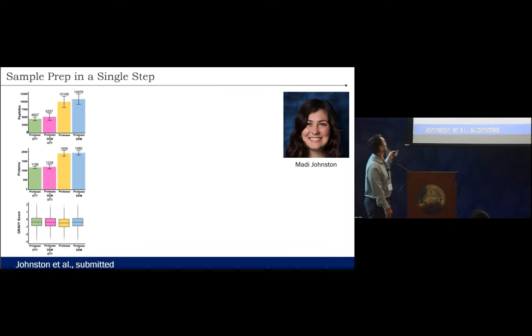So this is some work that Maddie is doing in the lab. And so what we realized basically is that our first step has always been heating up our sample in the presence of a non-ionic surfactant, dodecyl maltoside, DDM, for 1 hour at 70 C, okay? And then we came across this rapid trypsin, or rapid trypsin/Lys-C mixture from Promega that is stabilized to work well at high temperatures. They say you should incubate for 1 hour at 70 degrees C. Okay, so we just are basically omitting reduction. You don't have to omit reduction, but it doesn't do good things. I'm sure we're reducing trypsin and Lys-C.